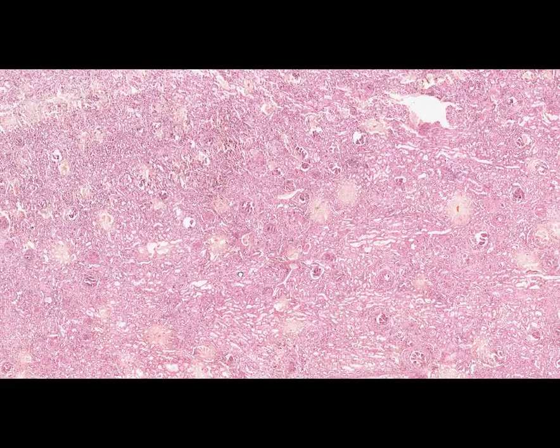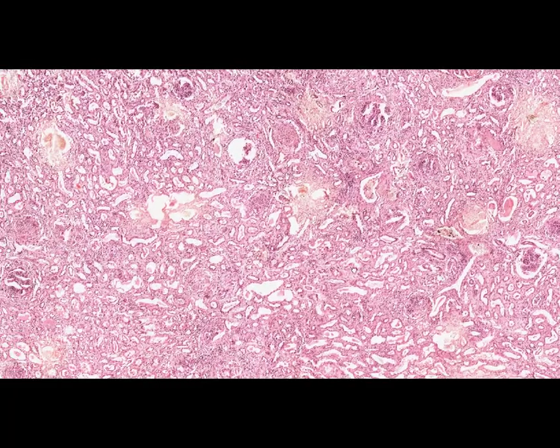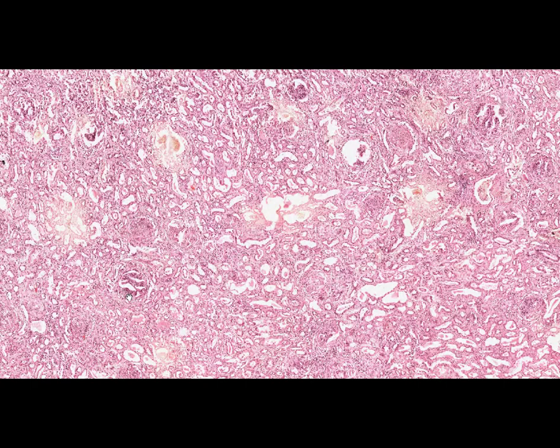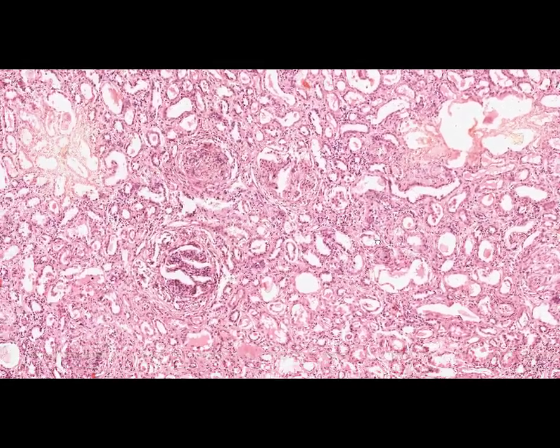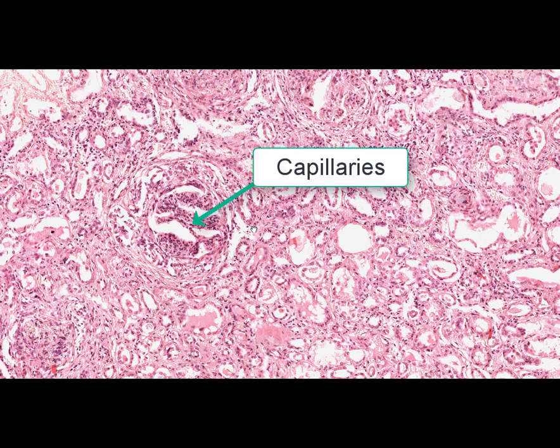At low magnification we can see renal glomeruli, tubules, and interstitial tissue. The main changes are found in the glomeruli. In most of the glomeruli, capillaries are compressed by proliferative podocytes, macrophages, and finally fibroblasts. These proliferative cells occupy the space of Bowman's capsule, creating so-called cellular crescents, which later are replaced by connective tissue to form fibrous crescents.